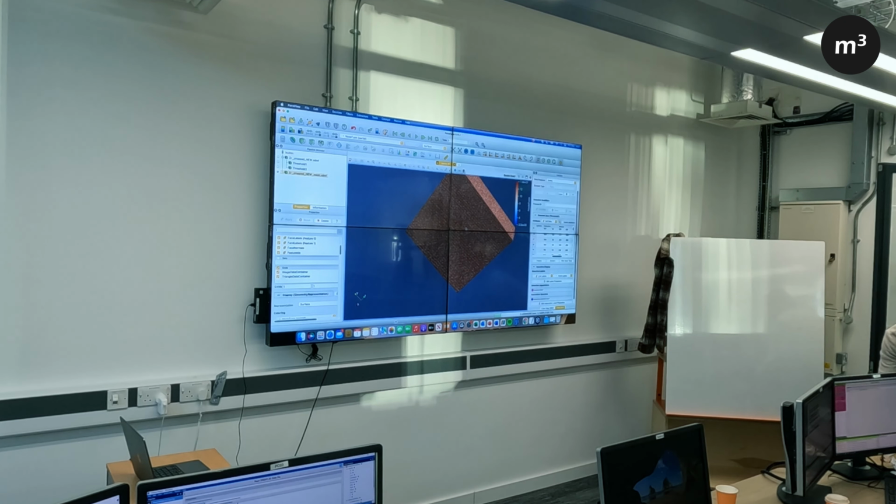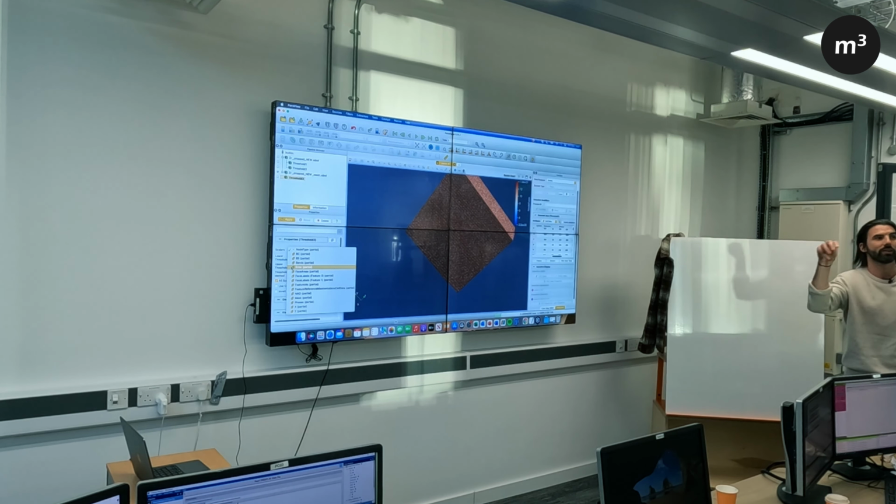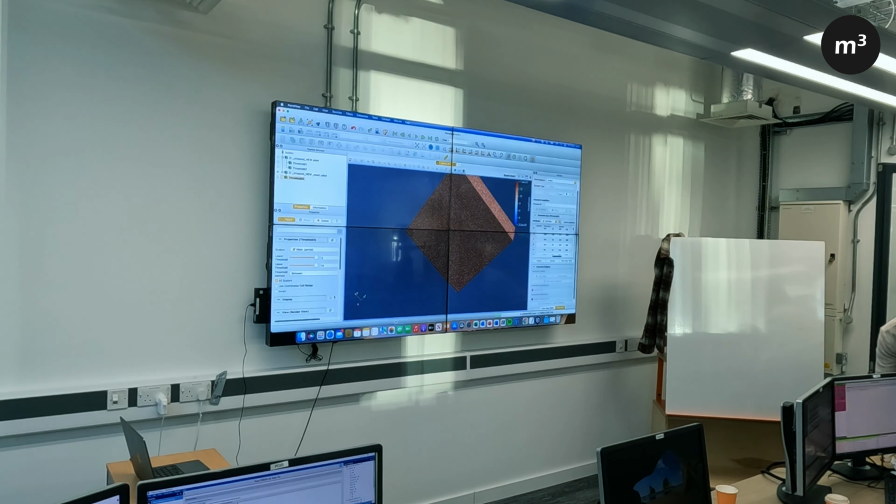So now it looks mental because this is all of our triangular segments of even our non-index data. So again, we can just do it as we did before. Now you will notice in your drop-down menu, you now have a number of other possible scalar quantities you can threshold against. Now you'll see in brackets partial after each one, and that means that it's not the entire data set, because now we have this extra triangle data container. Now we can threshold only on a certain subset of the data.